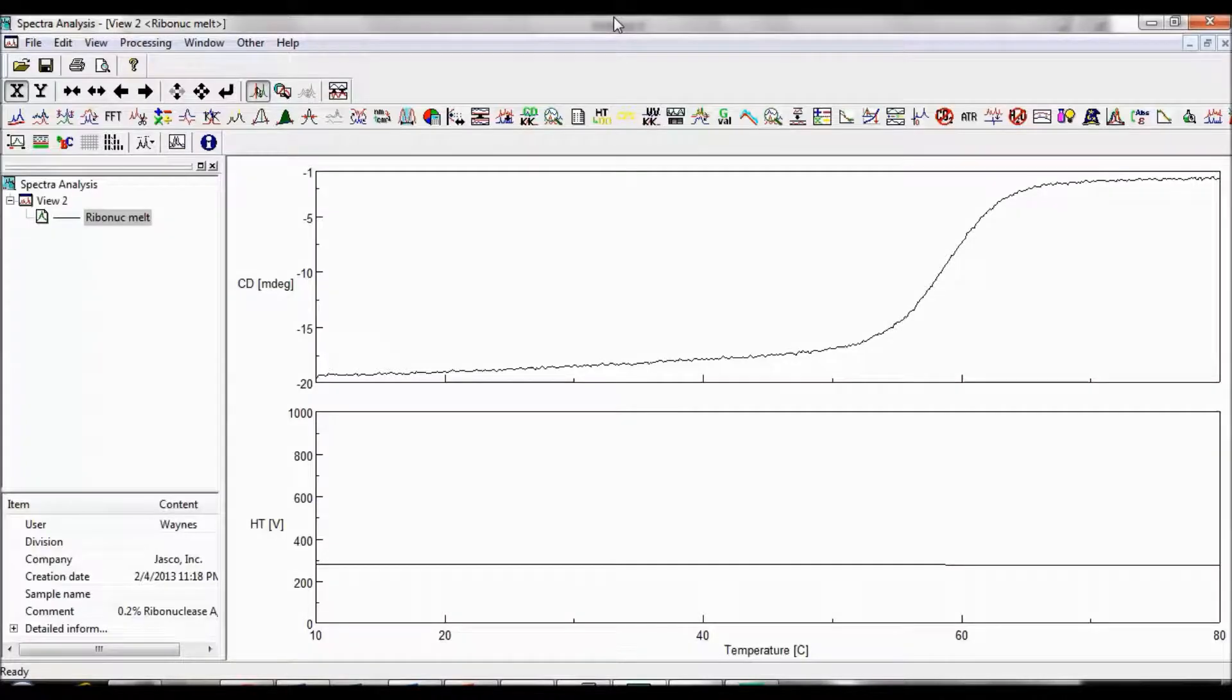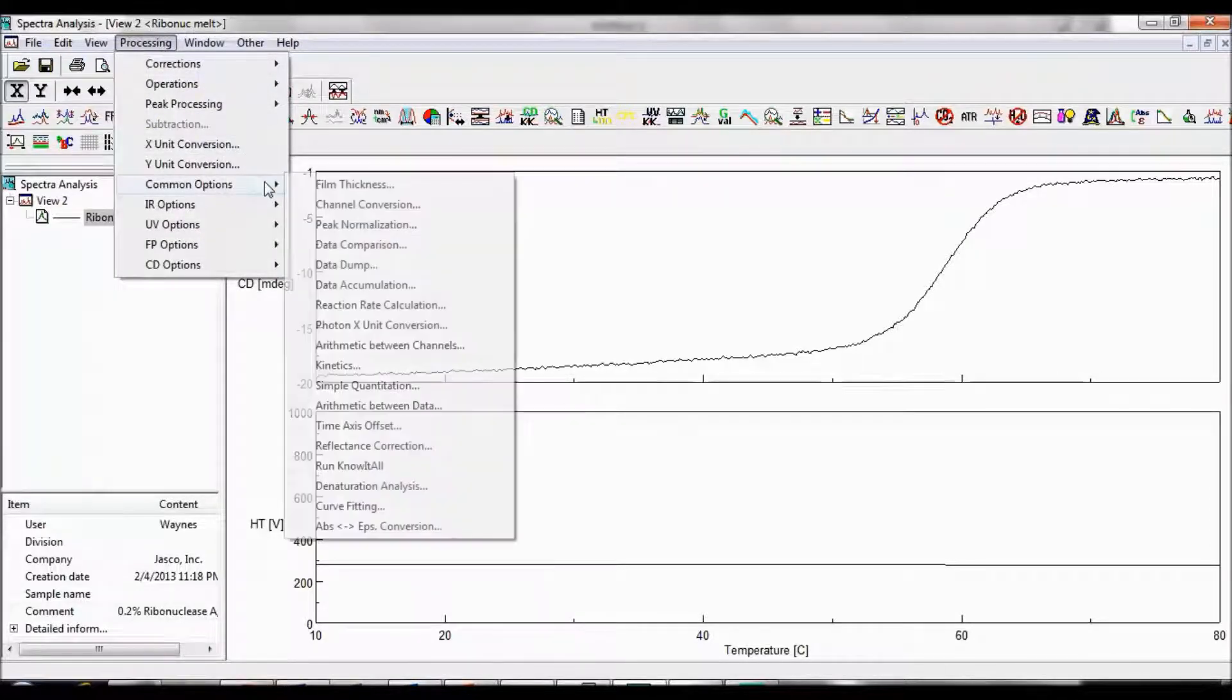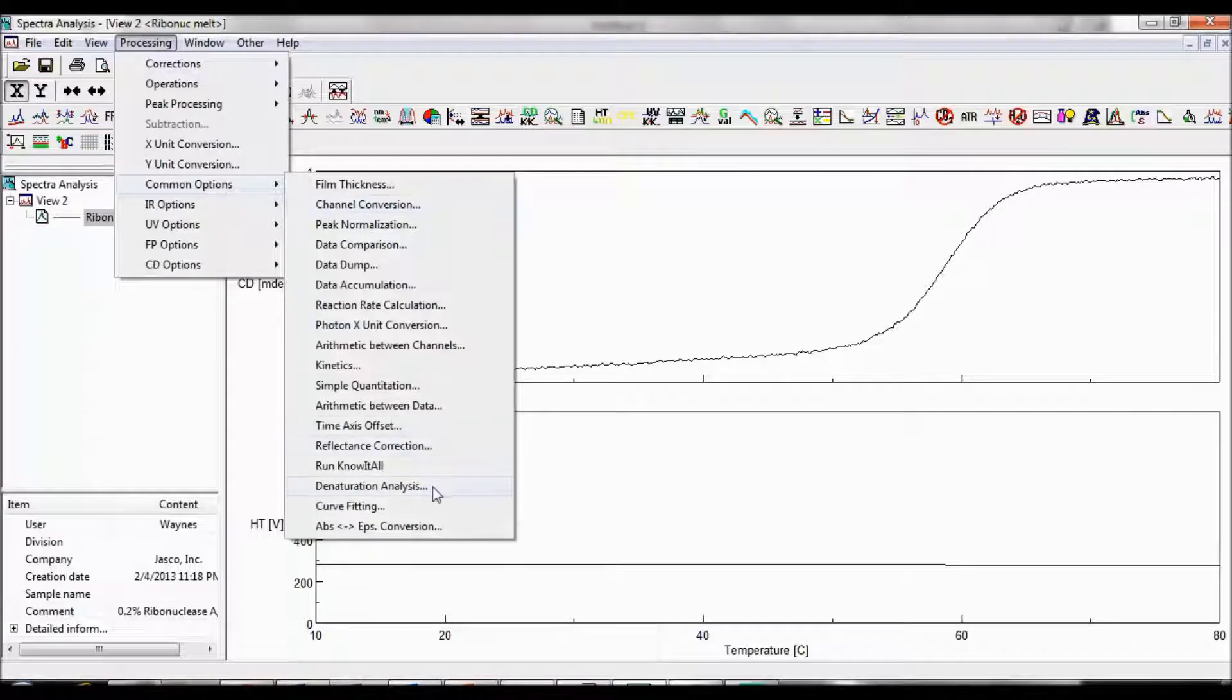Before starting the thermal denaturation analysis, make sure that the file you have opened is CD plotted as a function of temperature. Now we can go to Processing, Common Options, Denaturation Analysis.